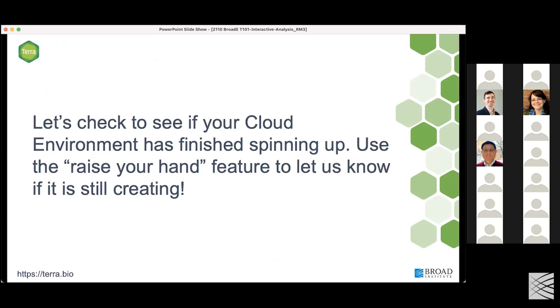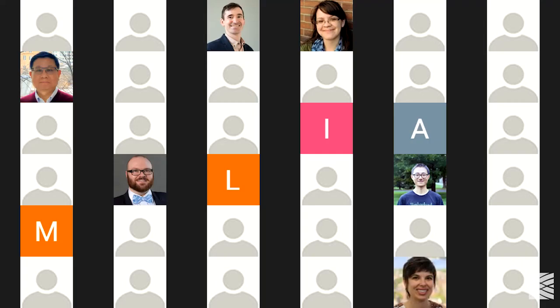All right, so let's go back to the browser. Let's check to see if your cloud environment has finished. It should have by now. If your cloud environment is still creating, maybe raise your hand, and our TAs can help troubleshoot. But you should be good by now. All right, so I'm going to go back to my browser.